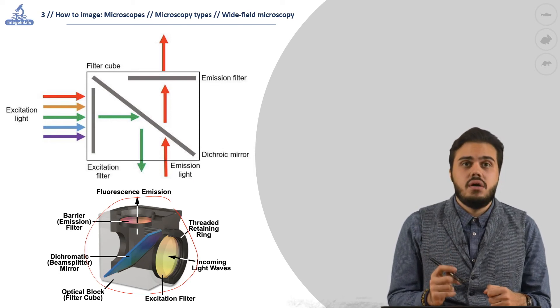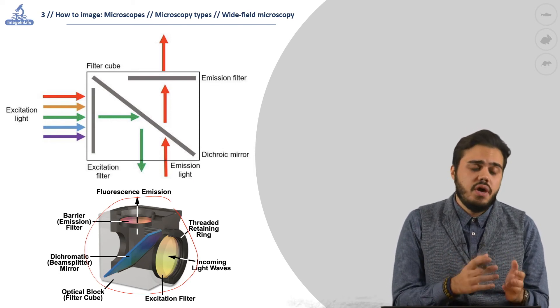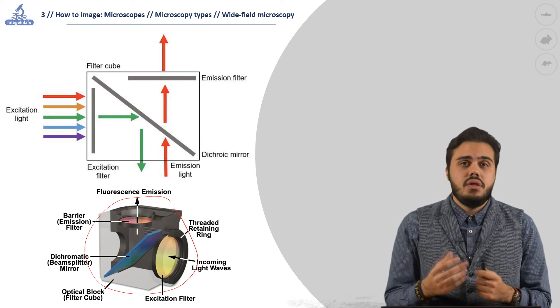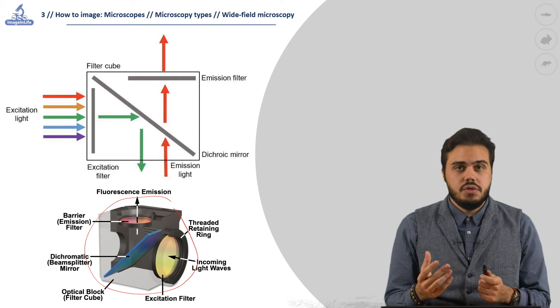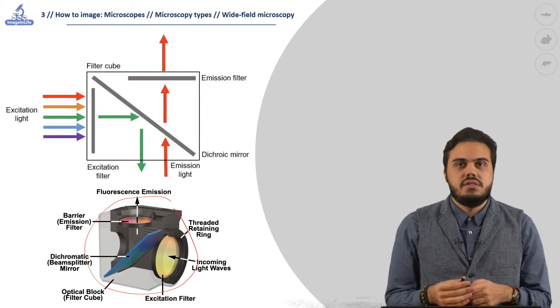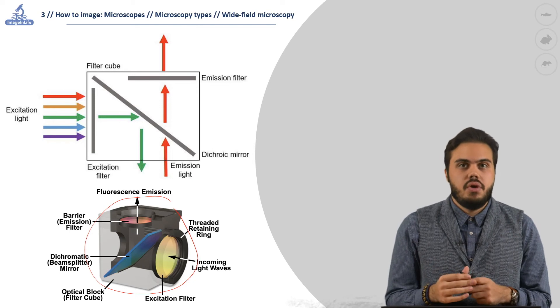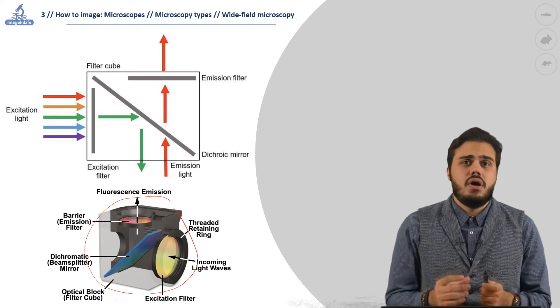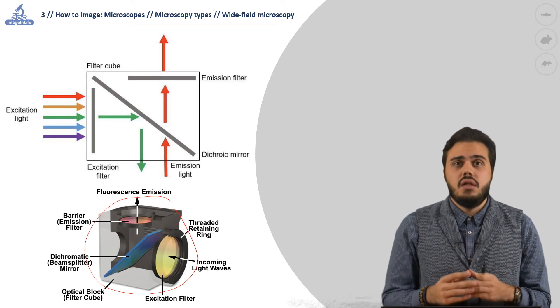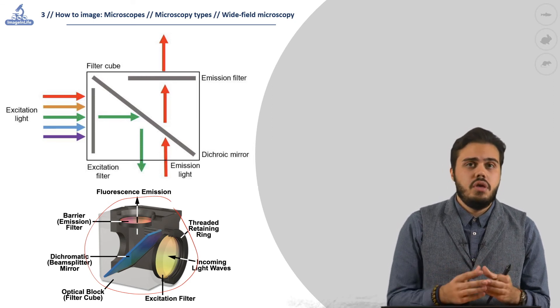Recently, the lasers that before were confined to technologies like confocal microscopy are entering fluorescent microscopy. This is related to the drop in price and size of such apparatus. The lasers offer a stable, focused wavelength that can be optimized and improve the quality of the image itself.